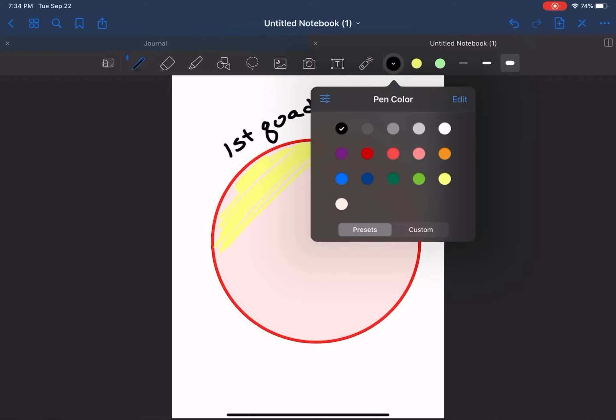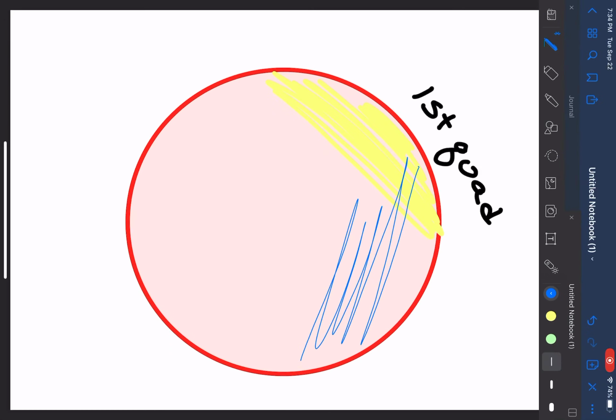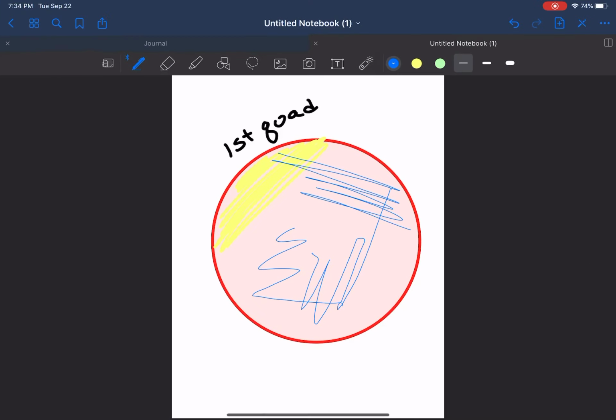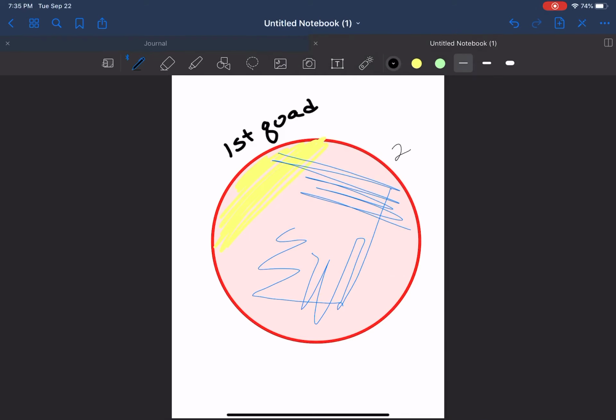Then we should have taken our blue loop, and using the blue loop, done some streaking for isolation. That's what we should have done, so that we had our first quadrant, second quadrant, third, and fourth, and then incubated that overnight. But that's not what happened.